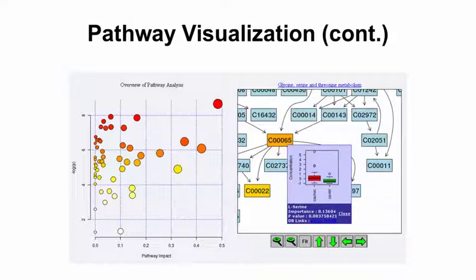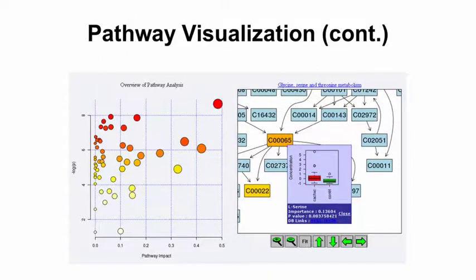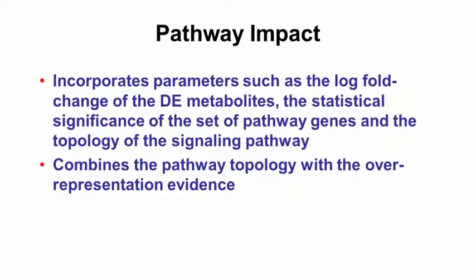We can zoom in on these pathways — it has a navigation toolbar so you can scroll right, left, zoom in, zoom out. Clicking on nodes will produce a box and whiskers plot. Notice, as KEGG always does, it gives you a KEGG identifier rather than the name. By clicking on it, you can now see what the compound is and how it differs between cachexia and non-cachexia. Eventually these will be replaced by SMPDB paths, which will be a little more explicit and obvious. The pathway impact is an integrated measure looking at both the change in differentially expressed metabolites and the statistical significance in terms of topology.